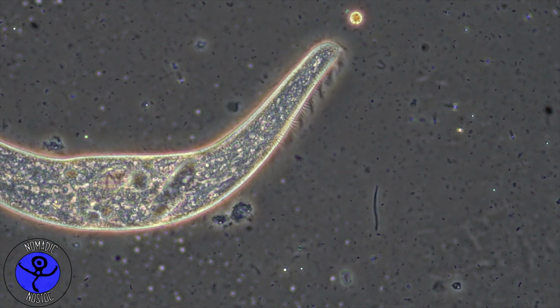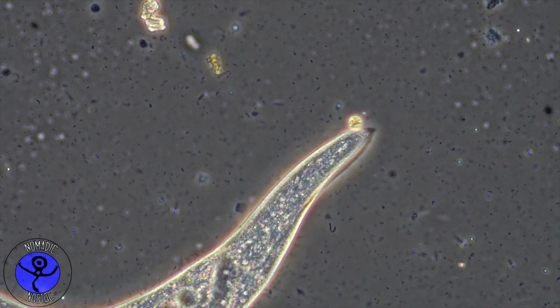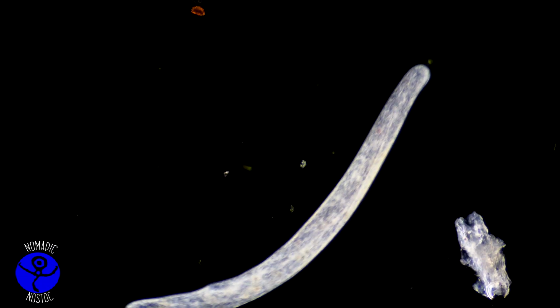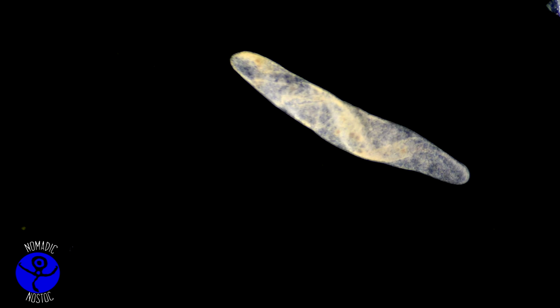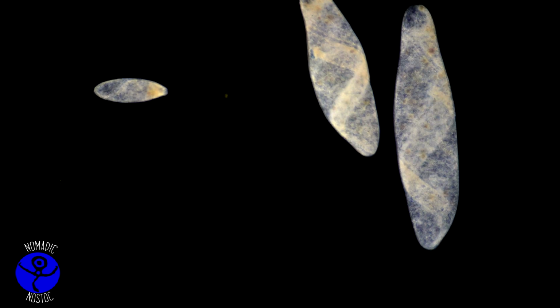They are absolutely fascinating. They have a few weird features up their sleeves. Spirostomum is able to contract itself within a fraction of a second to around 30% of its original length, which looks like this. They do this induced by external stimuli, for example vibrations, or chemical agents. They are especially sensitive to calcium ions. You can actually trigger a continuous reaction like this by introducing a lot of calcium ions into the water, for example calcium chloride.